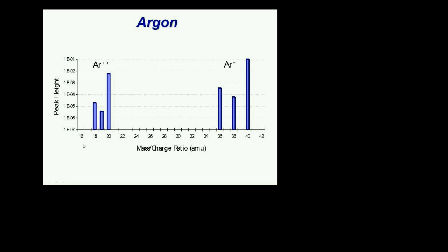This is a very important trick, and if you look at some of the closed ion source systems or even standard RGAs, you're going to find that sometimes they advertise a 35 eV mode. The purpose of the 35 eV mode is to allow people to do water measurements in the presence of argon. Okay? So we can go on like this with different examples of interactions, and different ways in which different gases can interact with each other.